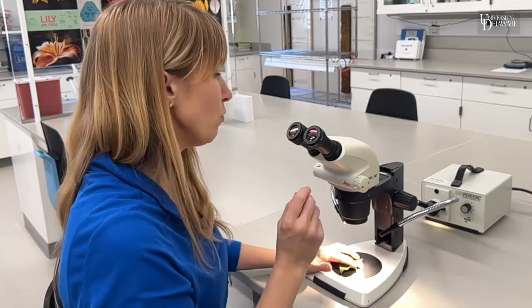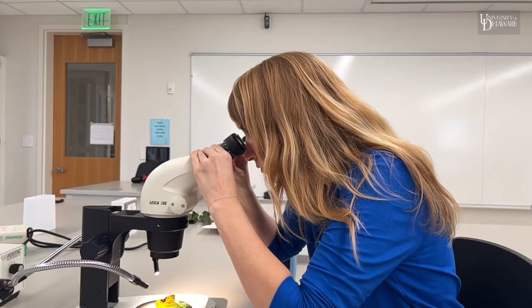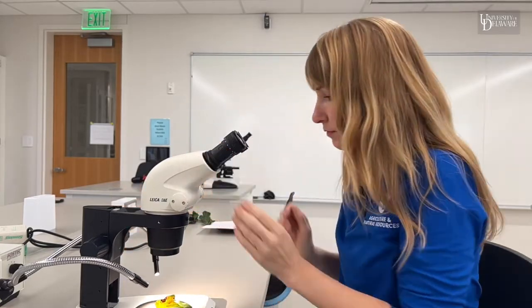The next thing you want to do is use these knobs here — these are the focus knobs — and just make sure your sample is in rough focus using these knobs.